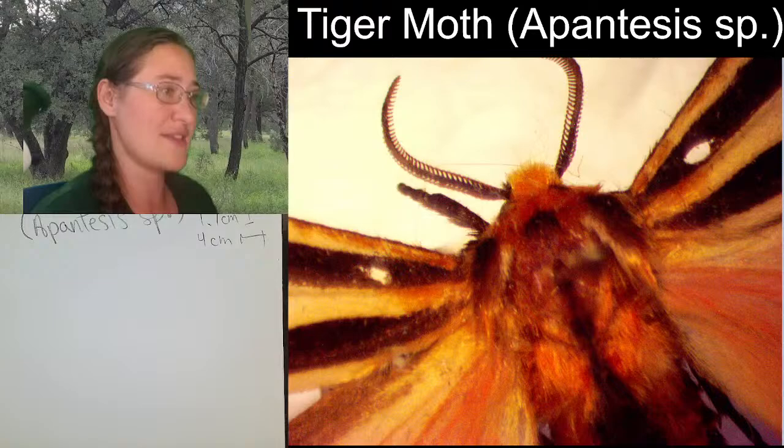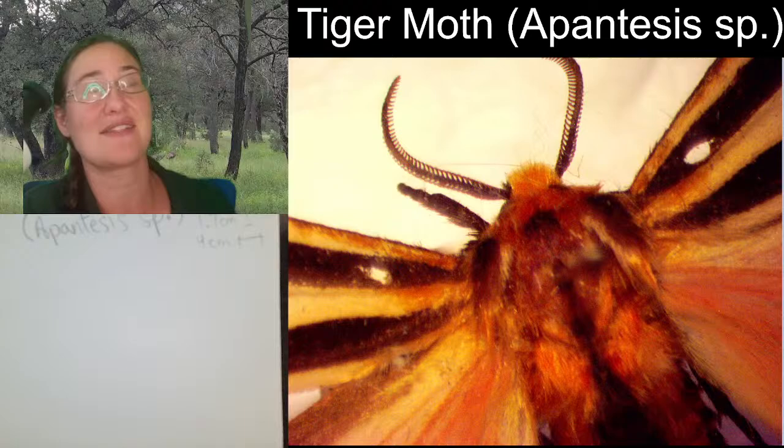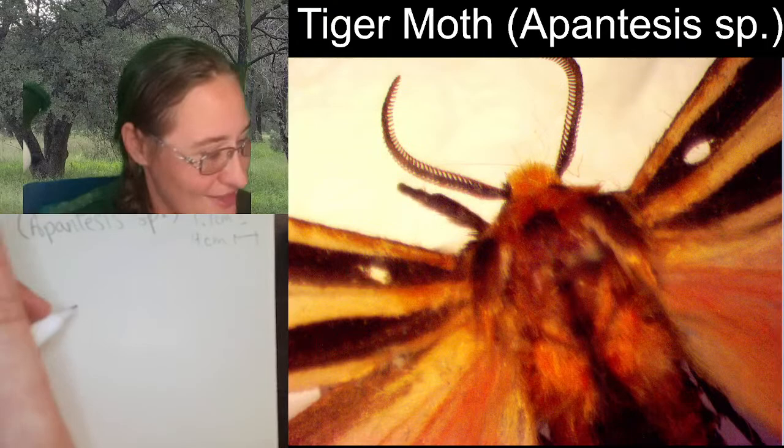Now, the first pair of wings are also connected to that segment. They just tend to be connected to the very end of that segment. So there's that. Okay, let's go ahead and start this.